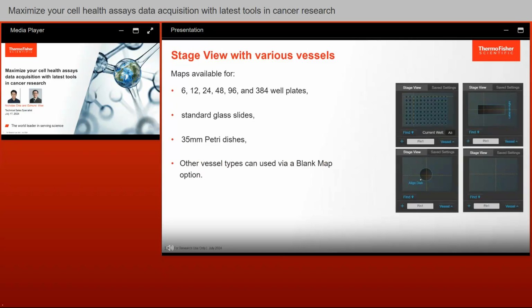Some cases where you can imagine using this feature are long-term cell growth monitoring. You do not want to put the cells on the microscope for a long period of time. You can take it out, image it, put it back in the incubator, and come back at a later time to re-image the same location. Of course, you can also mark areas of interest on histology slides. You can also find suitable candidate cells for physiological measurements. And if you are doing a teaching lab, it allows you to guide the students to view some biological samples when they are looking at the whole well plate or certain slides.